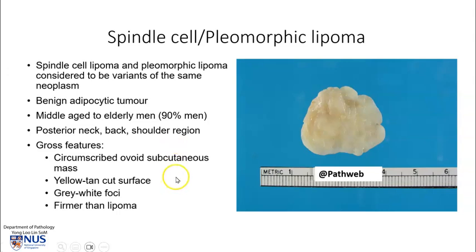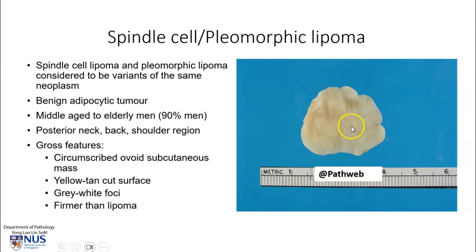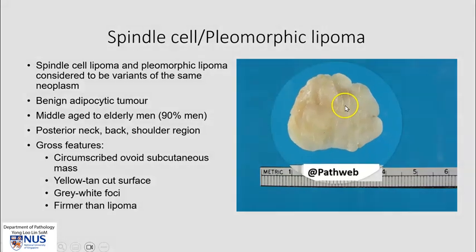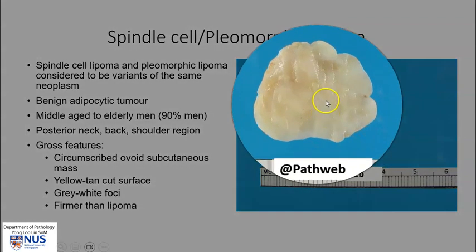Grossly, these tumours are also circumscribed. They are in the subcutaneous plane, and they have a yellow, tan cut surface. They tend to be firmer than a regular lipoma, and you can see here that there are some whitish areas.